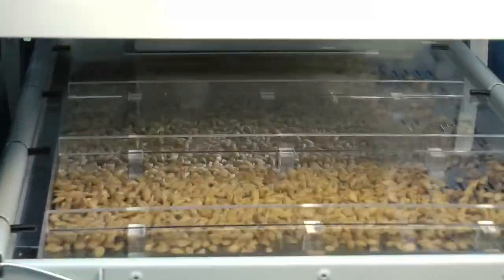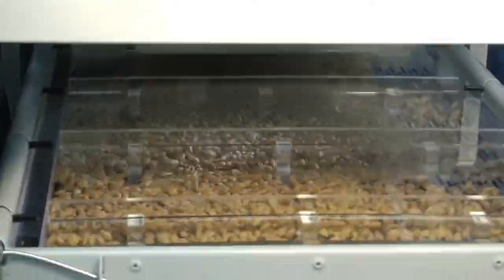A system of rubber balls will automatically do the cleaning for you. Very handy, right?